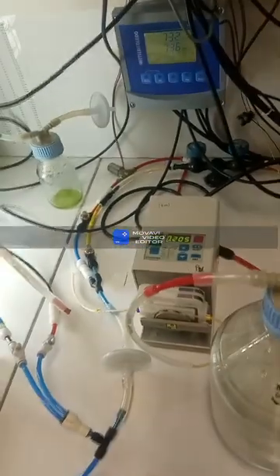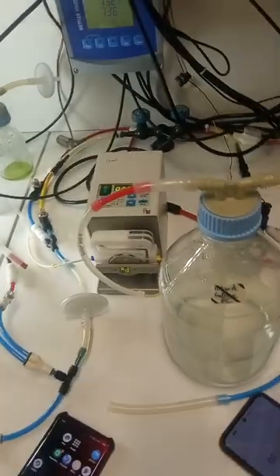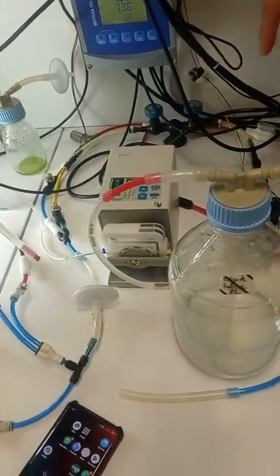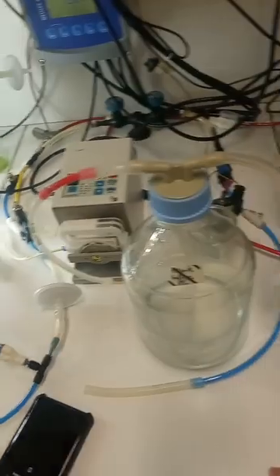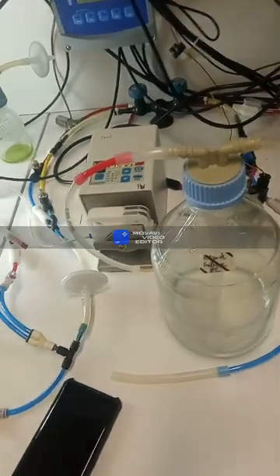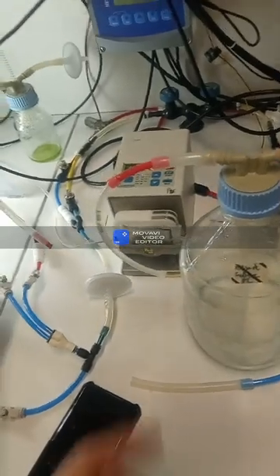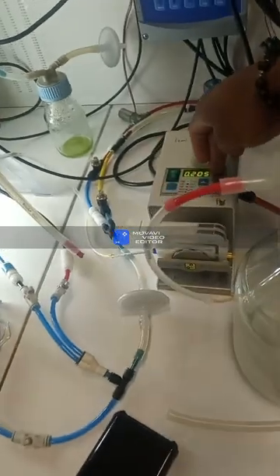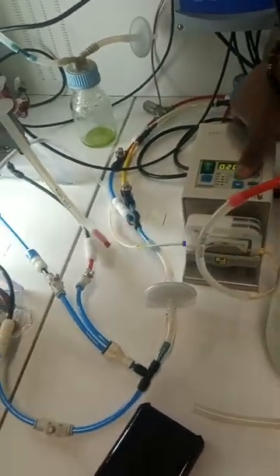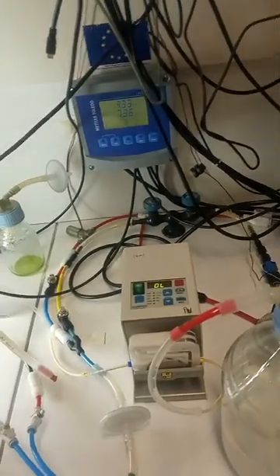How much should I put? 1 ml? Did you put run? It's not working. How much flow should I allow? We will see, depending on the time. It is in continuous mode and it's flowing. Maybe we will restart it because it will be too low, I think. We'll put the maximum first. 20.5.